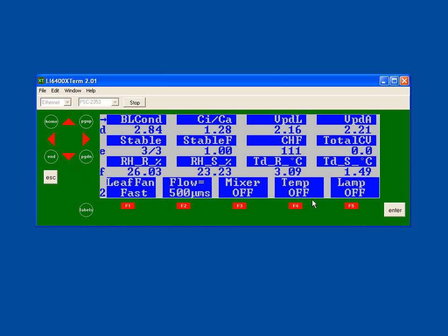The bottom line in the display we call menu level, and you'll notice that that line is numbered. If you look at menu level 1, you will notice it has a lot of file operations there. You can open a file, you can close a file, you can view a file, and also match mode appears on that line. To change the menu level, you can either press the number of the line you want to go to. If I press number 2, I'll go directly to that. Otherwise, I can press my labels key and it will scroll through all of my possible menu levels.